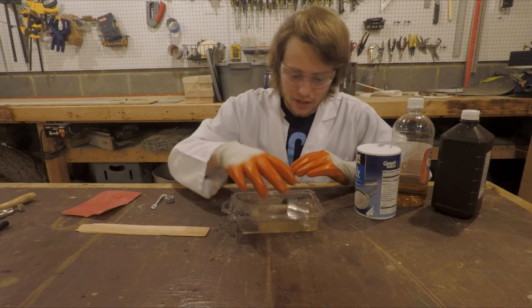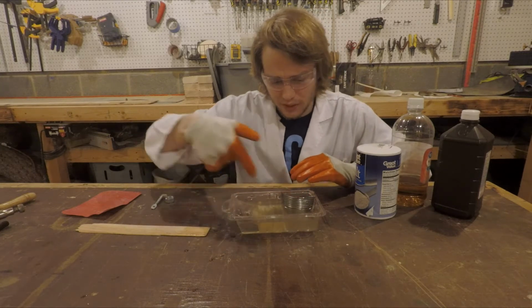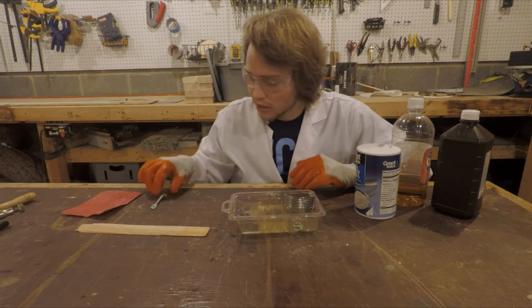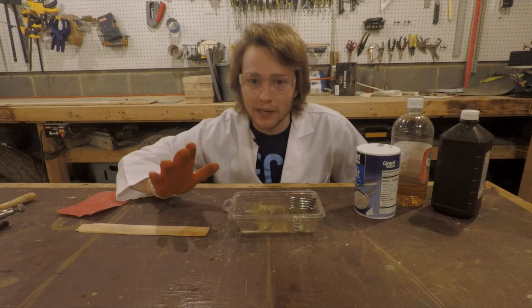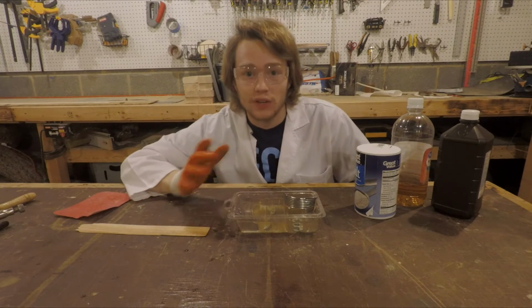So there we go. I want this bottom side to rest because it's clean to see. So throw those in there. It should be covered. But once we have this in there, it will take a few minutes, however long you want really. The longer you leave them in there, the rustier they will get.